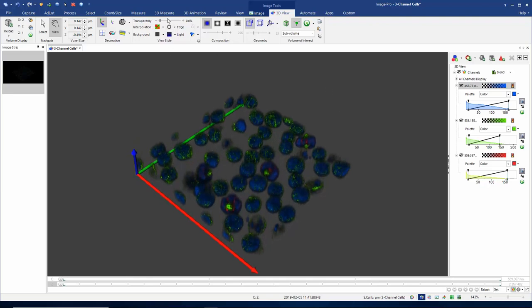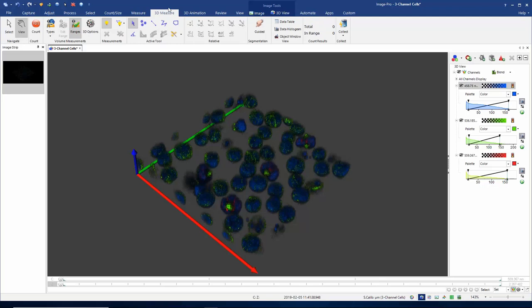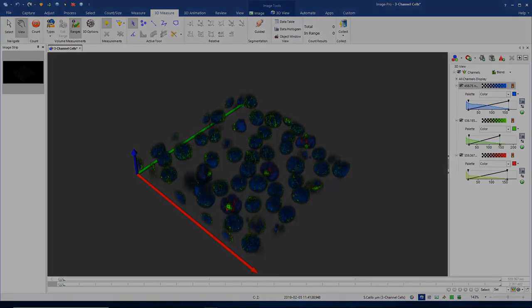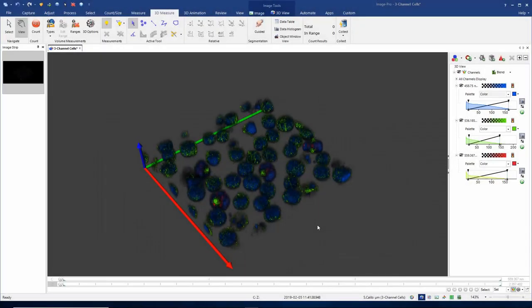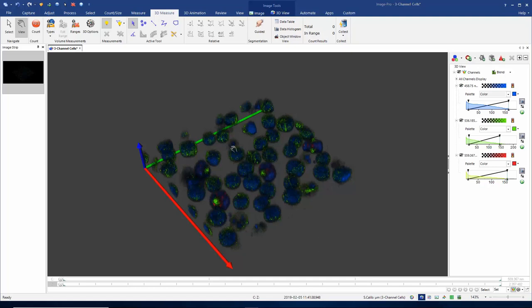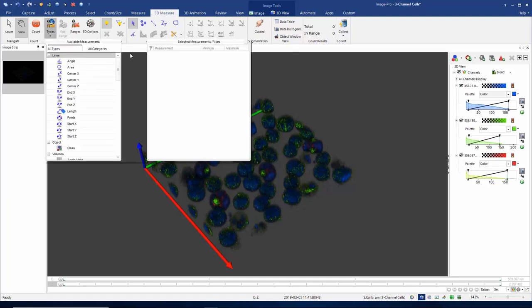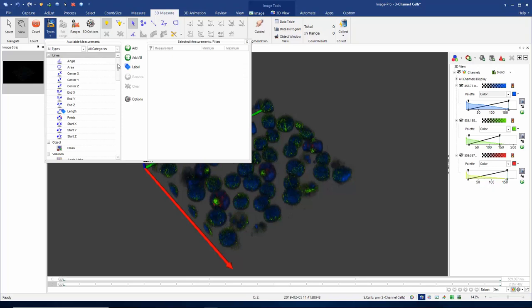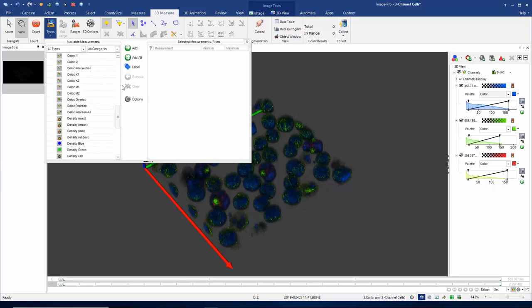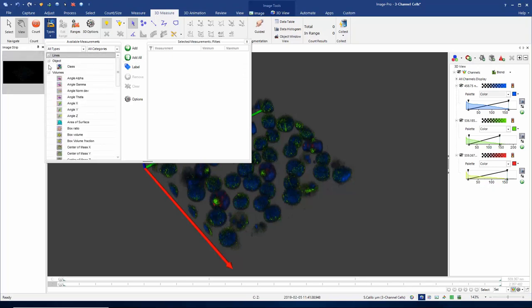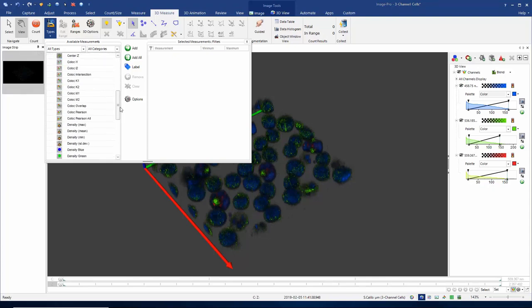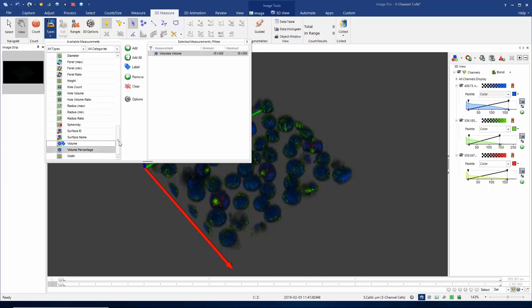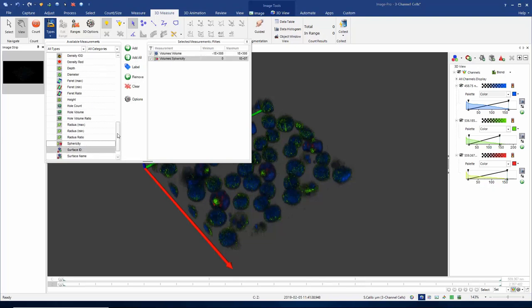Now I'm going to move on to the 3D measure tab. We're going to do a 3D analysis. I now need to tell the software what measurements I'm interested in making on each of my 3D objects, so I'm going to go to the Types button. In the dialog that opens, I can see all the different types of measurements that it's possible to make. These have been categorized as lines, objects and volumes. It's volumes that I'm interested in, so I want to measure the volume of each of my objects, the sphericity, and I'm going to add diameter.